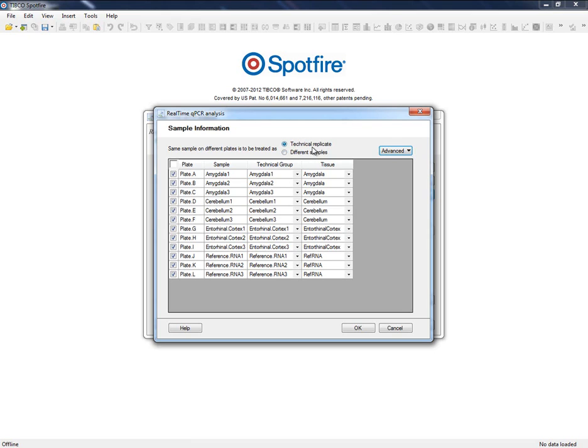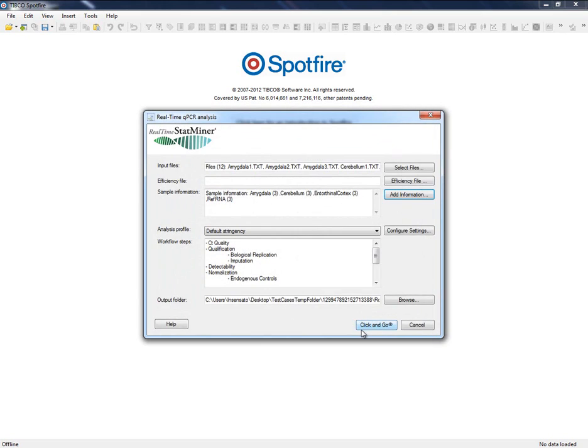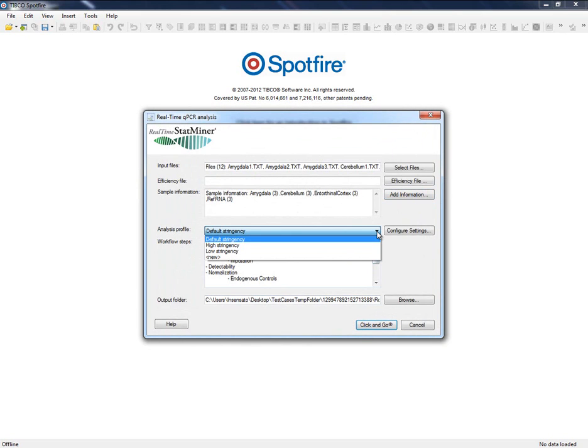Now let us continue with the analysis settings. StatMiner proposes a set of default analysis configurations, so we are now ready to perform the analysis.